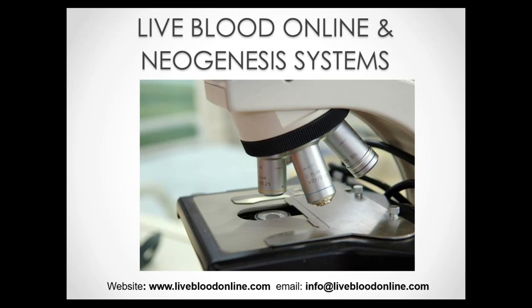And then the fourth point to make is that live blood analysis provides you, as the practitioner, with the means to demonstrate the negative effects of unhealthy dietary and lifestyle choices. This is a very, very powerful one to have in practice, because as practitioners, we understand what constitutes a healthy diet and lifestyle. And in fact, many patients do as well.